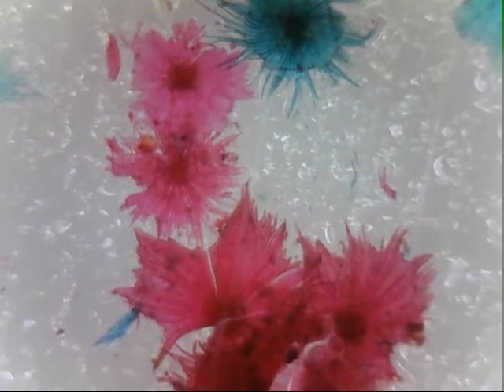Generally it's from Asia and Australia, although there are some in America and the Philippines. The picture I'm getting for these is about the same as what I'm looking at right now. It's pretty interesting because it's basically a flower, but it's small.